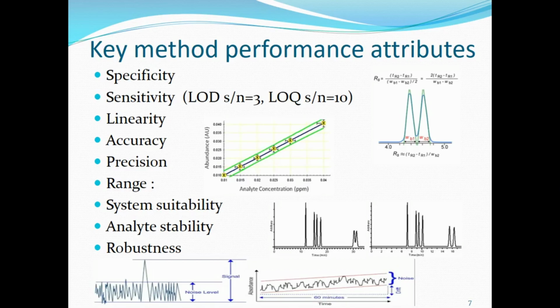Precision, or variability, refers to the agreement among the individual test results when a method is applied repeatedly to the same homogeneous sample. It's really a measure of the degree of repeatability or reproducibility of a method, and normally it's expressed as percentage RSD for a statistically significant number of samples. It's commonly evaluated as 3 separate measurements: repeatability, reproducibility, as well as intermediate precision.